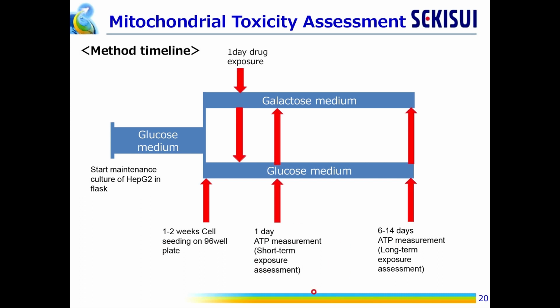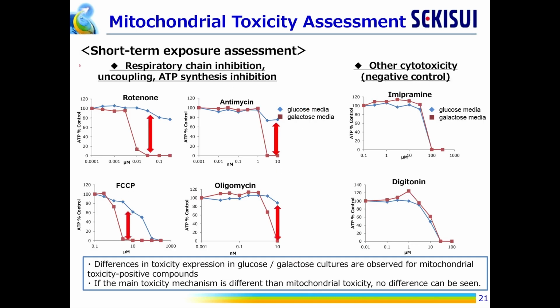That is the case of a short exposure assessment. When conducting long-term exposure assessment, we culture cells with each medium and test article for 6 to 14 days. In the data I'll show later, we expose cells for 10 days. So here, I share results from short-term exposure assessment.